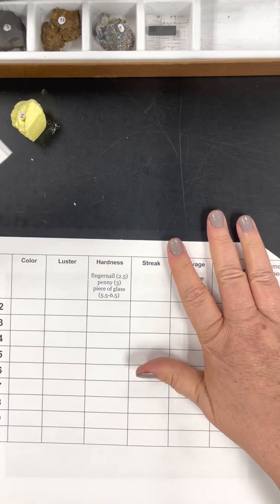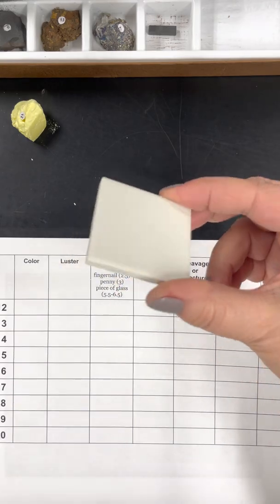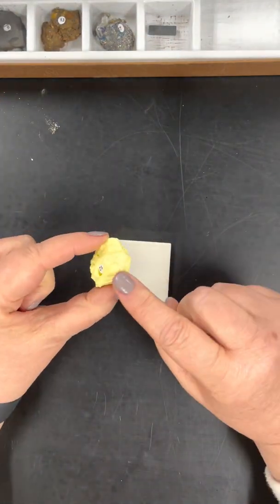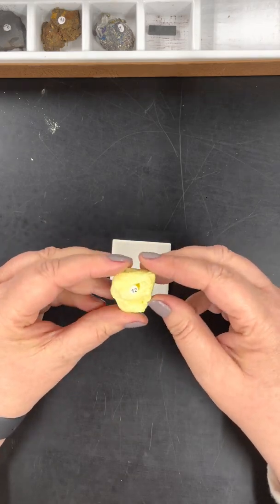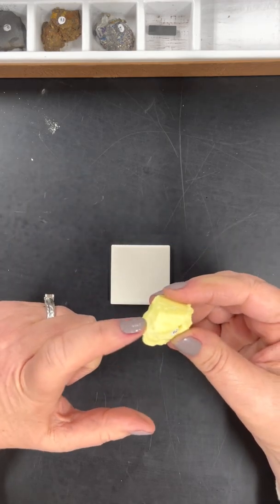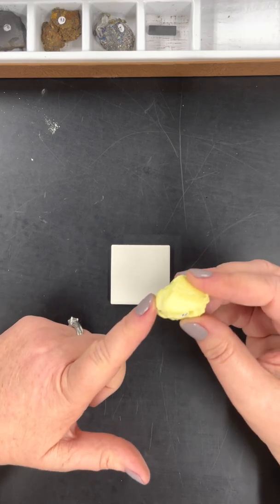Streak is a little bit challenging. You're gonna take, this is called a streak plate. Let me get my paper out of the way. You're gonna use the streak plate, and what we see here is the mineral on the outside. And a streak is, once I scratch it on this plate, you might think that it's gonna scratch off yellow, but sometimes the streak is actually a different color than the mineral.